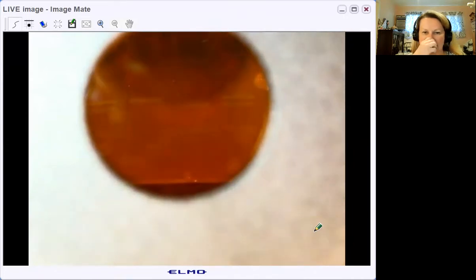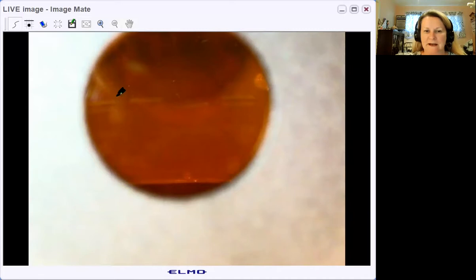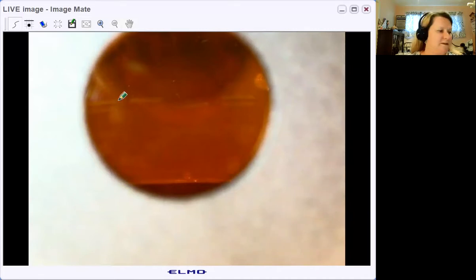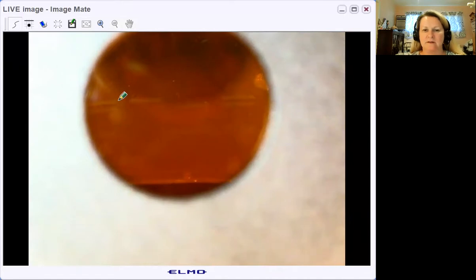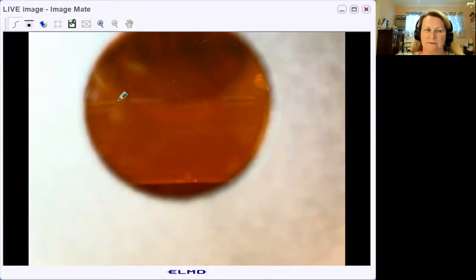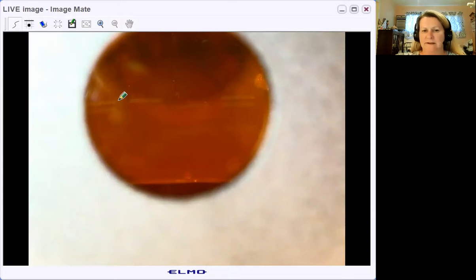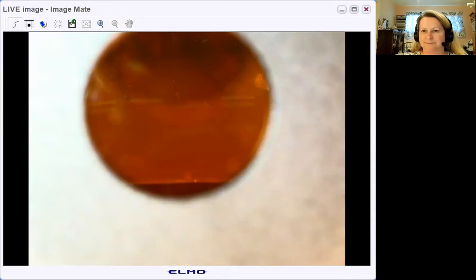You can see through the hole in the dome I've got the UV light on. You can see the separation of bands you get in just 15 minutes. One of the reasons I love this system is that you can run the whole lab start to finish in less than a 50 minute period, which is the time limit a lot of teachers are kind of stuck with.